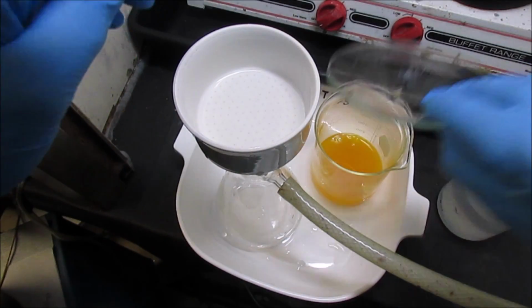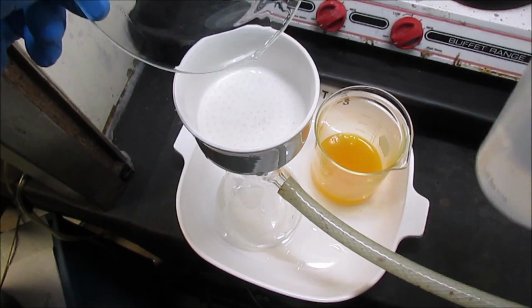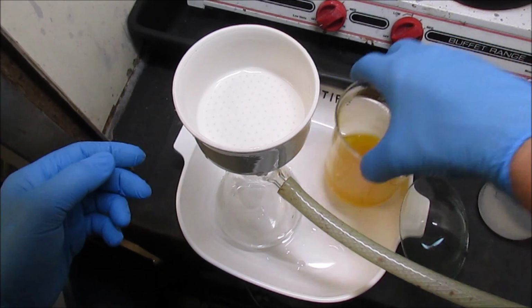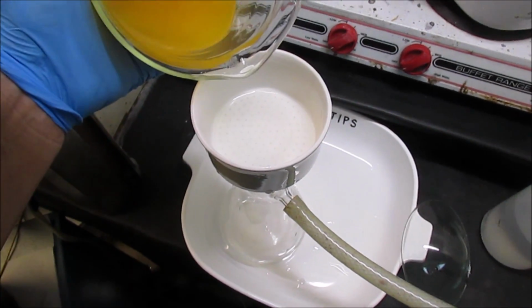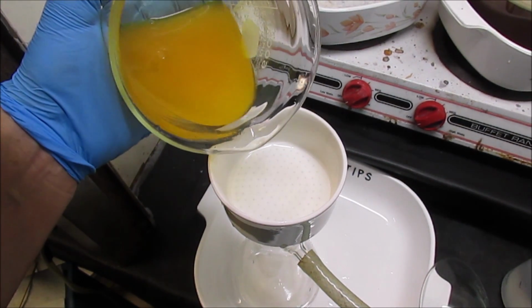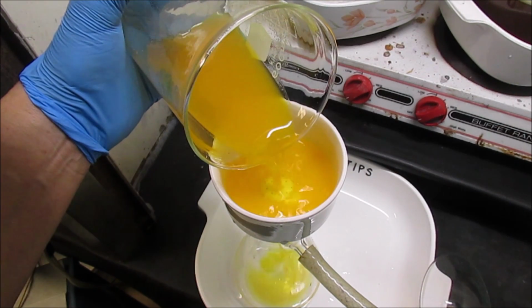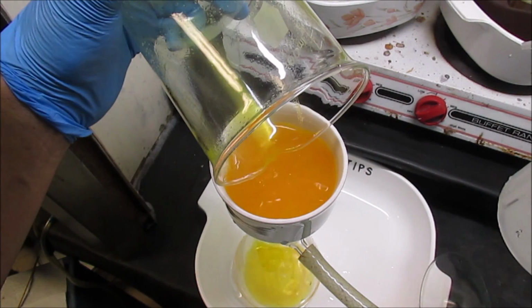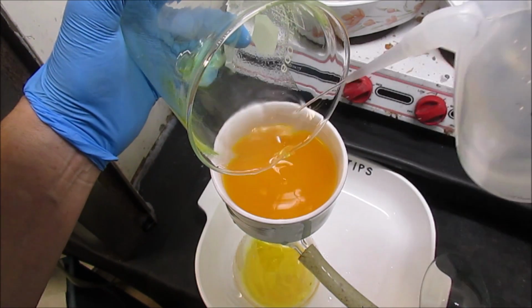Alright, here we go again. Fourth time. That copperas that I added didn't quite look right when I went to get it. I went ahead and added it anyway. It looked kind of slushy. Didn't look like nice green crystals like I'm used to seeing. I think there was a problem with the copperas. Man, what a way to waste time, you know?